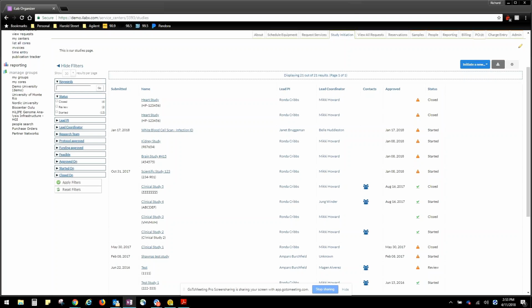Thank you. It does, I guess, you're right. It does help when there are folks on the call who are doing studies currently. But I think this is definitely giving us a good flavor. That approval checklist, is that configurable?